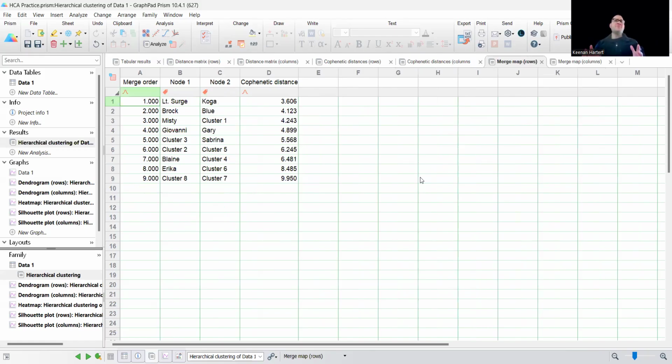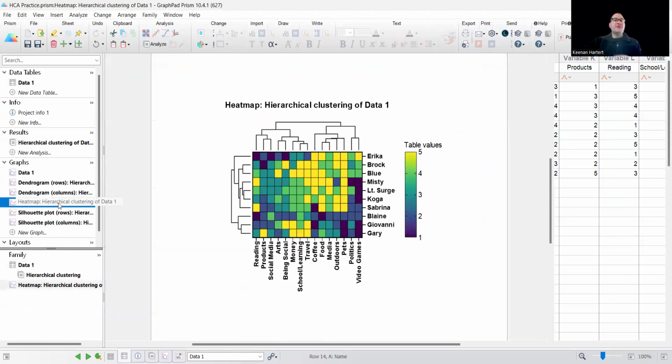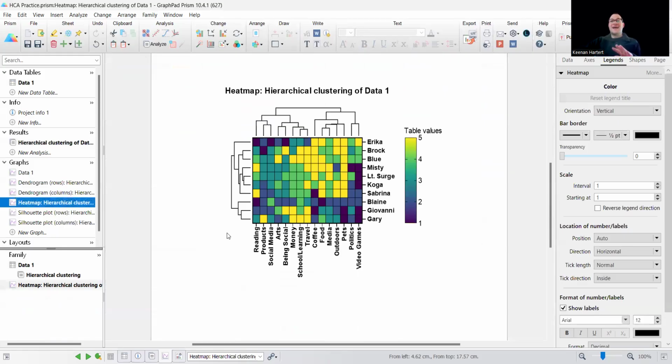This is a new capability of Prism. It fits really well with the multivariable setup. Again, it takes some moves. Like I said, make sure that you have a title set up with your labels because some pieces use the labels, some use the title. Perfect. But otherwise, you are looking at making a lot of sense out of a lot of data.